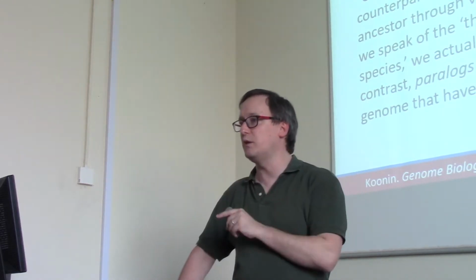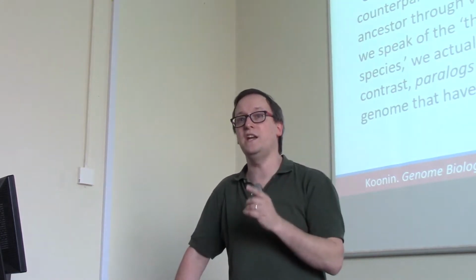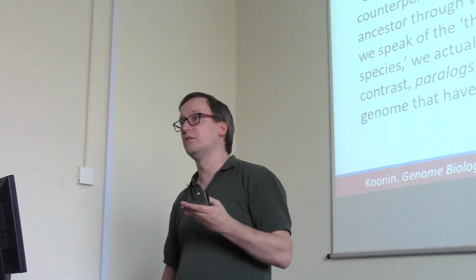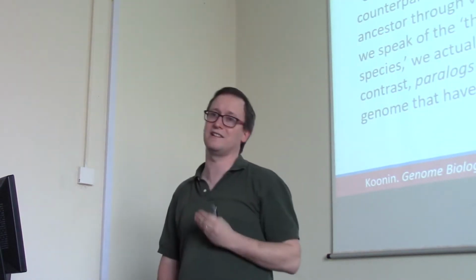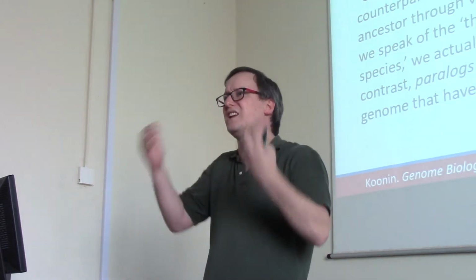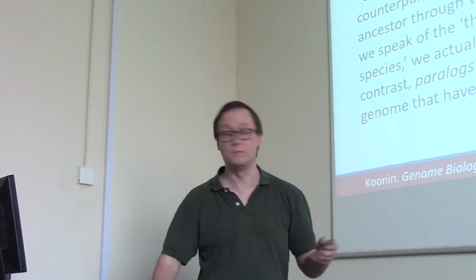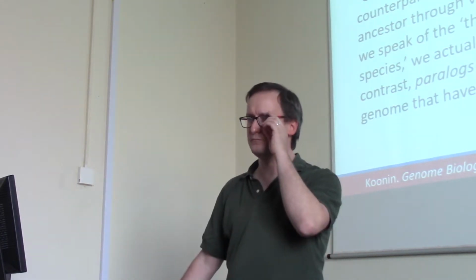If you are working with a sequence database that contains many, many species, you will find that orthology is a problem. If you find a peptide for human actin, it might mistakenly make you think that orangutan actin is present, or chimpanzee actin is present. So orthology creates a problem in that you might mistakenly think you've identified a peptide from an altogether different species than your sample represents. That's awkward. Next, you might have a case where paralogs are present.